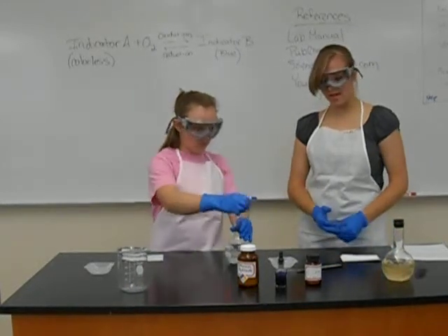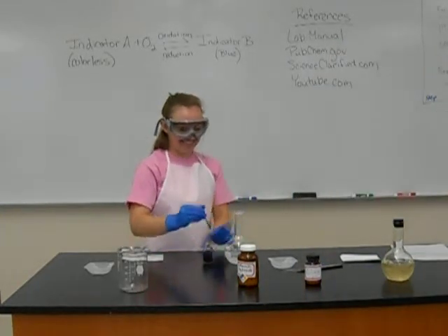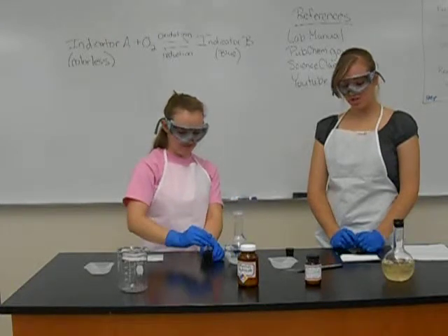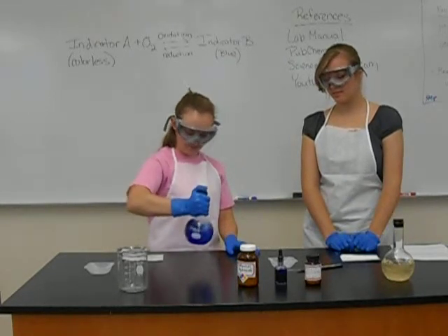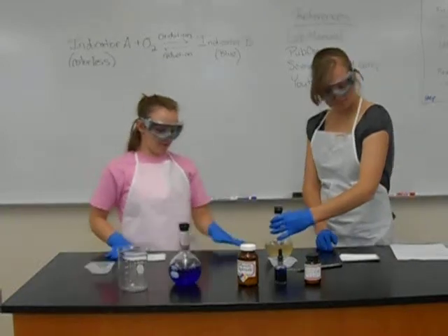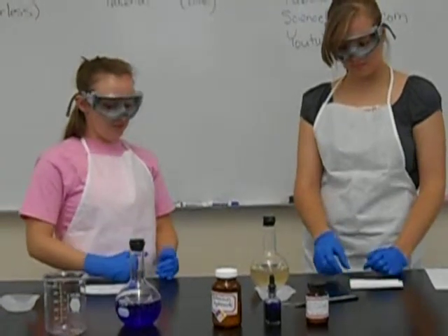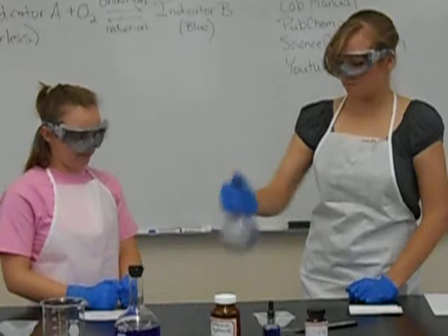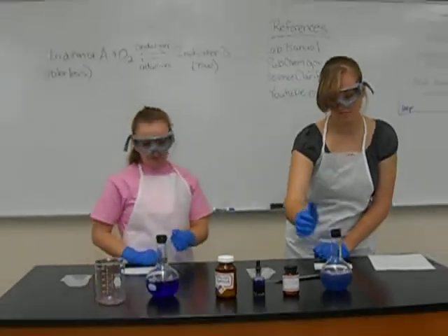Add the 7 drops of methylene blue indicator. And she'll give it a swirl. And now it needs to sit undisturbed for about a minute. To save time, we've already prepared the solution ahead of time, and as you can see, it's clear. And to connect our experiment, we're going to swirl it up and it will turn blue. And this can be done multiple times.